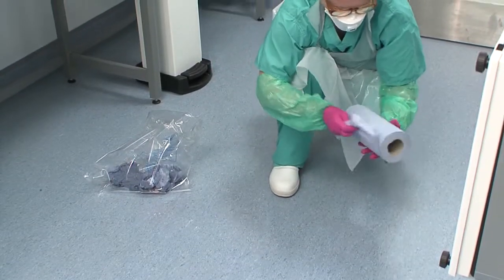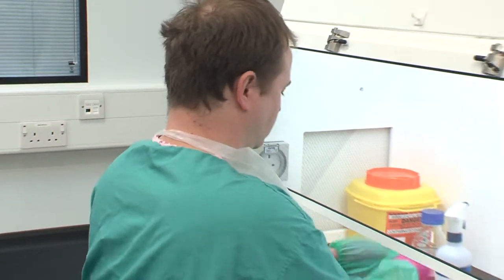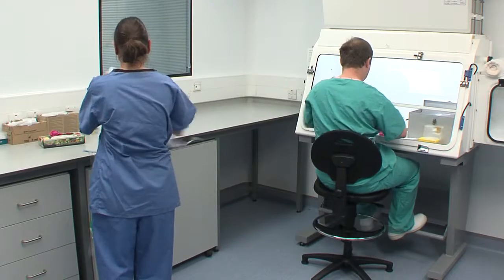in the lab waste. With any spill involving Category A viruses or a large spill involving a Category B or C virus outside a safety cabinet, all personnel within the laboratory must be notified. All staff must vacate the facility immediately, according to the contingency procedures detailed in the risk assessment.